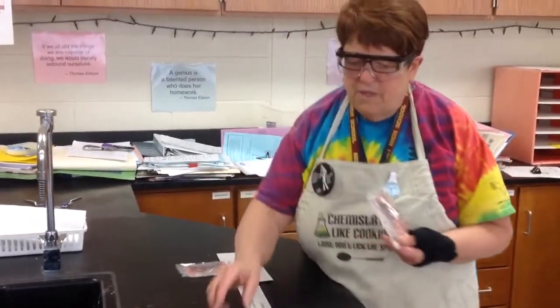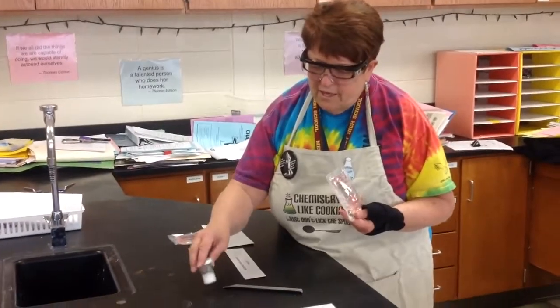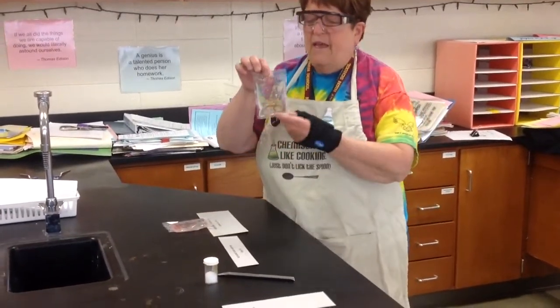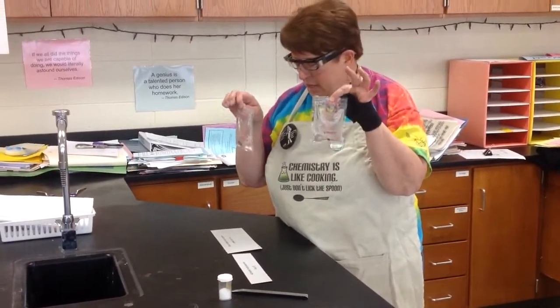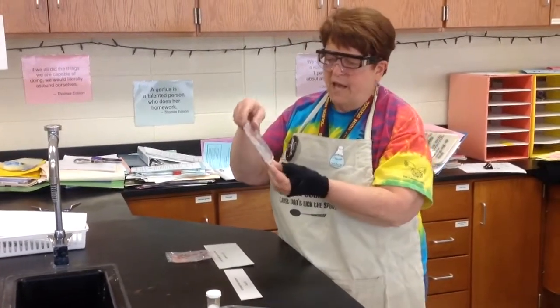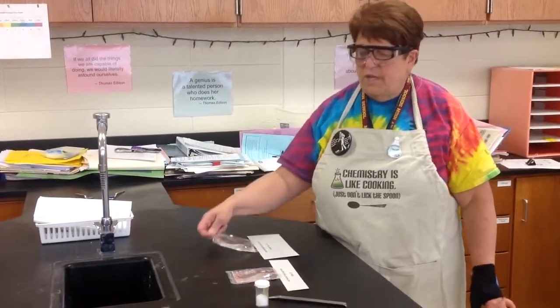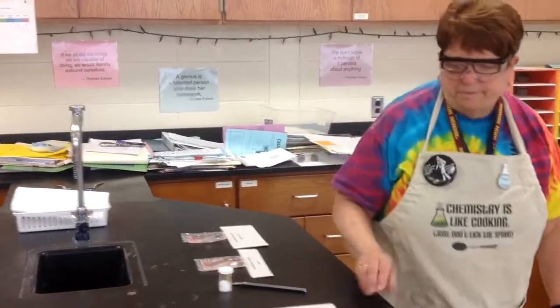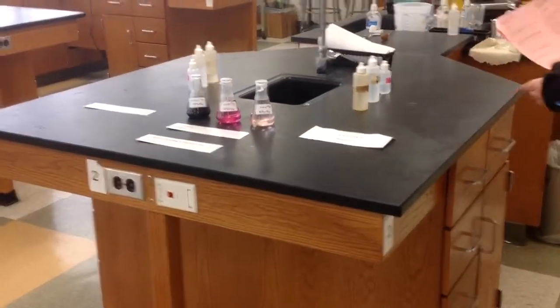In these hand warmers, the same substance is in here that was in the test tube I just had, sodium acetate in supersaturated solutions. These are both unactivated right now. We will activate one at the beginning of class and leave it here, and then leave the other one unactivated, please. Station 4. Station 5 is at table 2 since we switched 2 and 5.